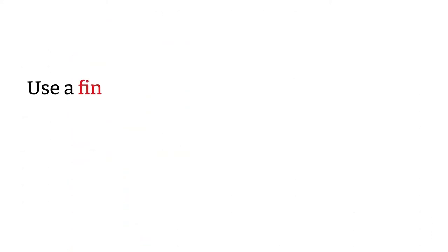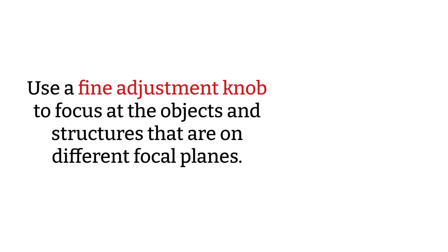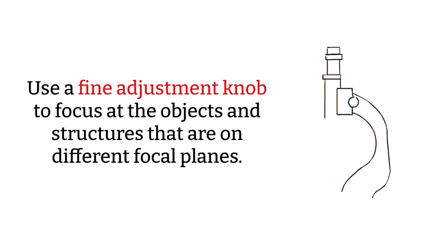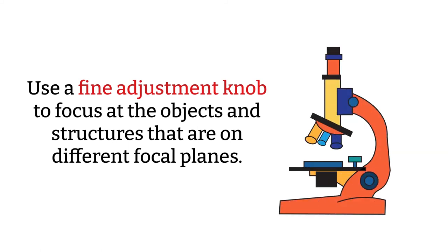Third, most laboratories have a microscope assigned for the urine bench already, so you won't have to do much adjustment. Use the fine adjustment knob to help you focus. During the examination, you would want to keep adjusting the fine adjustment knob constantly to look at the objects and structures that are on a different focal plane.